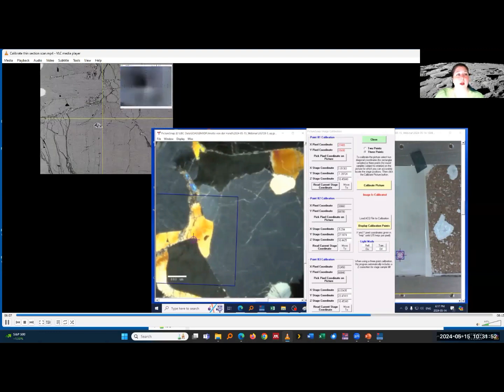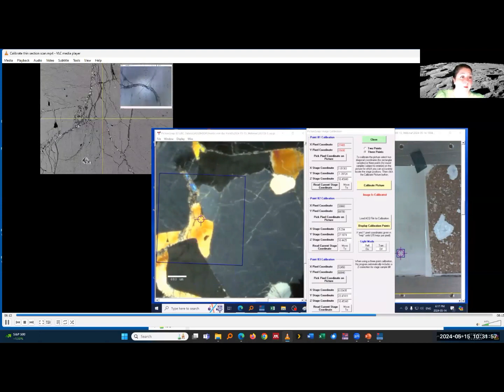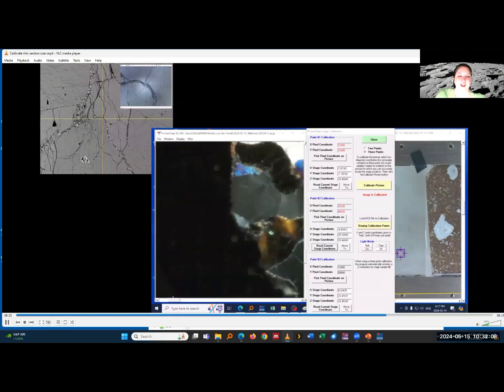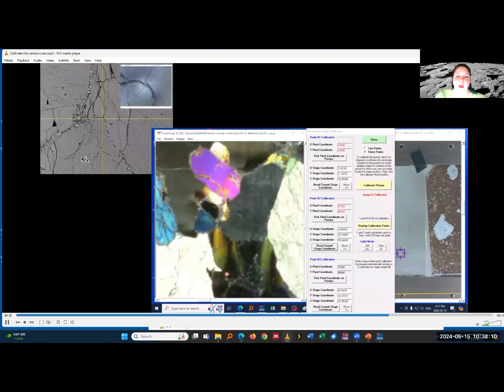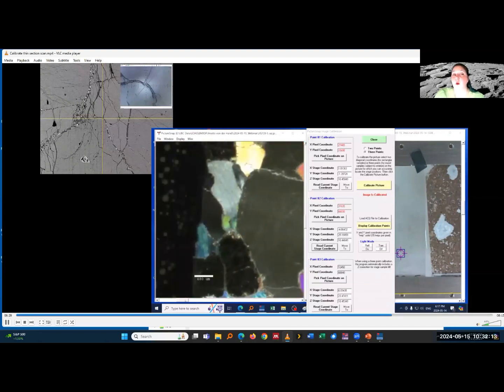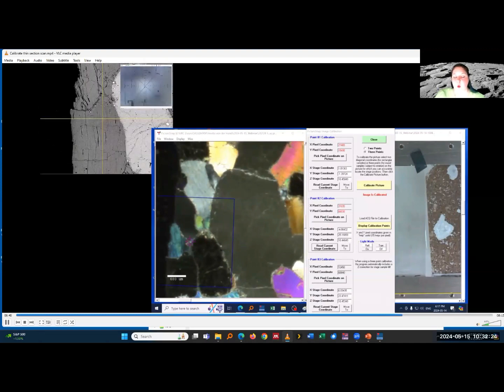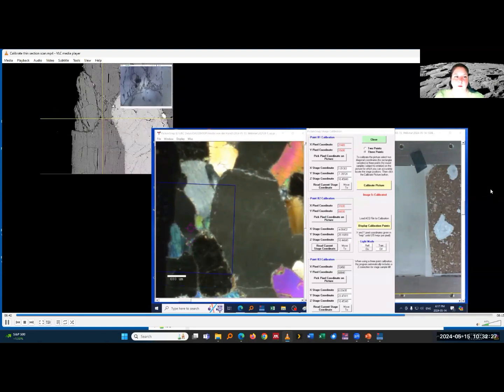And so boom, I have my other calibration, my next file calibrated. And so that's also then the easy way to make use of CL images. I go down in magnification essentially of the images and have easy control. And I can only do that by having both softwares running on the computer, so that I can essentially have two different files open at the same time. Okay, good. So that was how the calibration works.